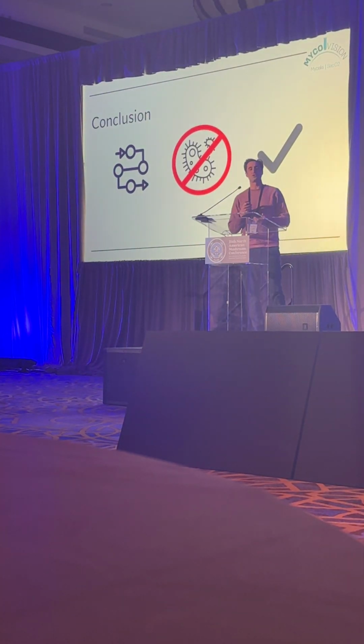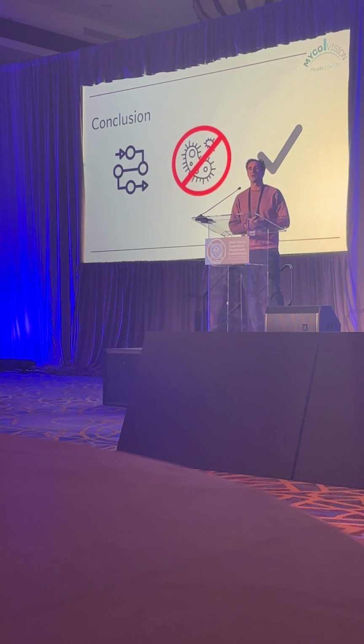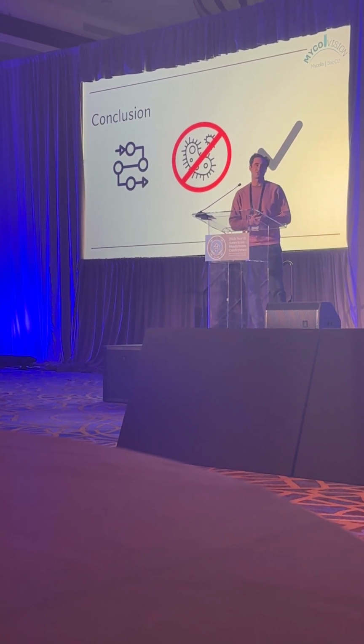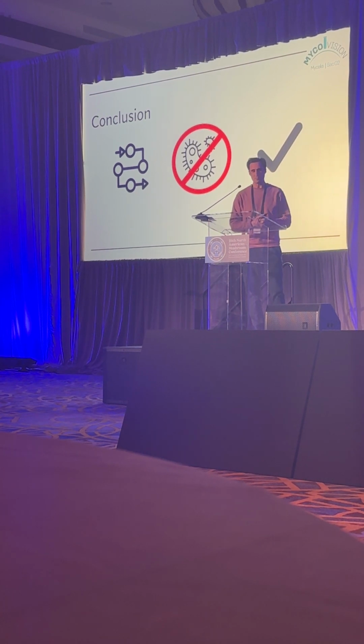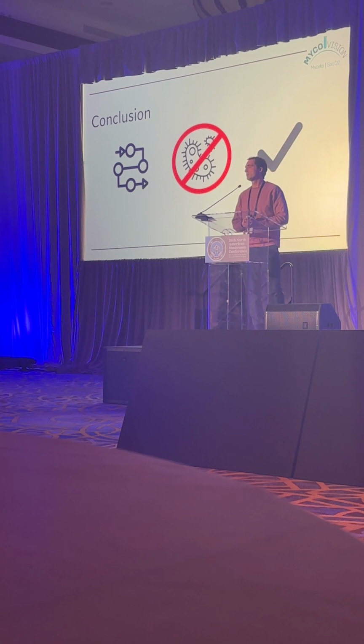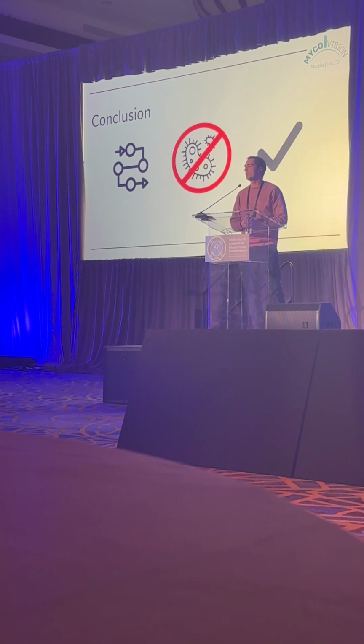Okay, so in conclusion, we are very proud of our setup. We find that the trials that we run are affordable, which is of course very important. They are repeatable and reproducible, which is of course very important. We don't have a lot of issues with contamination because our contamination rate is below 1%, which is like half a miracle by itself because we're working in one of the corners of our warehouse.